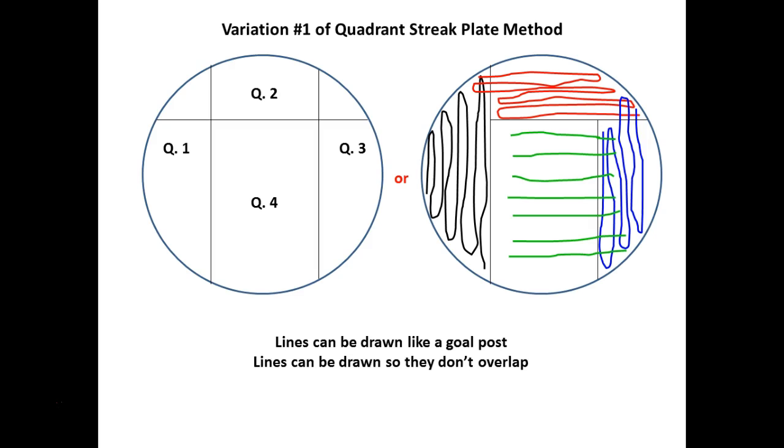You don't have enough space to do that in the others. There's no right or wrong. The goal is decreasing the number of bacteria as you move from one section of the plate to the other, but actually picking some up too, from one section to another.